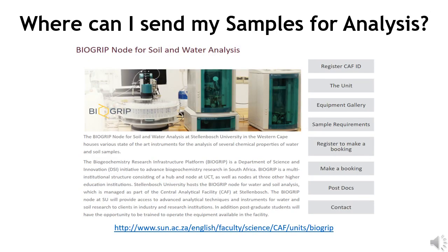So, where can I send my samples for TOC analysis? TOC analysis can be performed at the BIOGRIP node for soil and water analysis, which is situated at Stellenbosch University in the Western Cape. The BIOGRIP node houses various high-end analytical equipment, amongst which is the Elementar Vario TOC cube, which is capable of measuring the carbon content in both liquid and solid samples. A link to the website is provided.